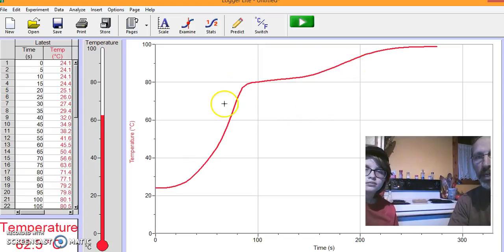I'm thinking that we heated it too quickly. I kind of know what happened here. I'm going to ask Josie to try and explain a few things. So earlier I asked you what you thought the graph would look like, and you gave me this. You said it would go up. But obviously when you heat things, the temperature goes up. Does this graph look like what you were expecting?